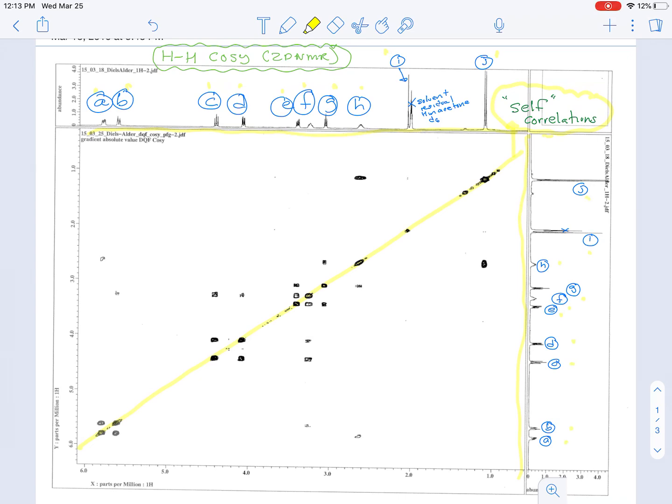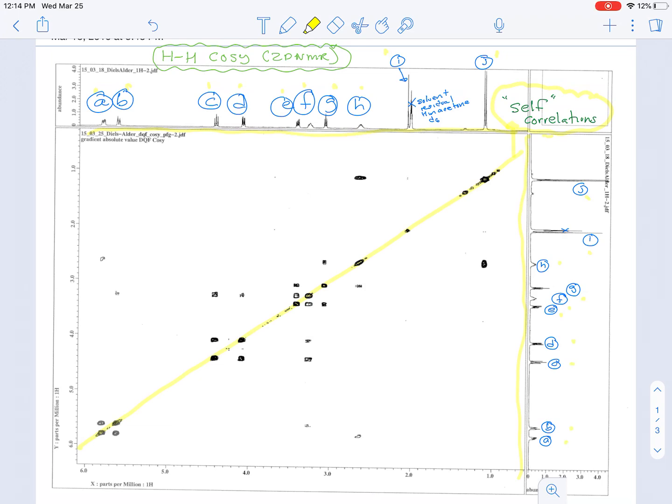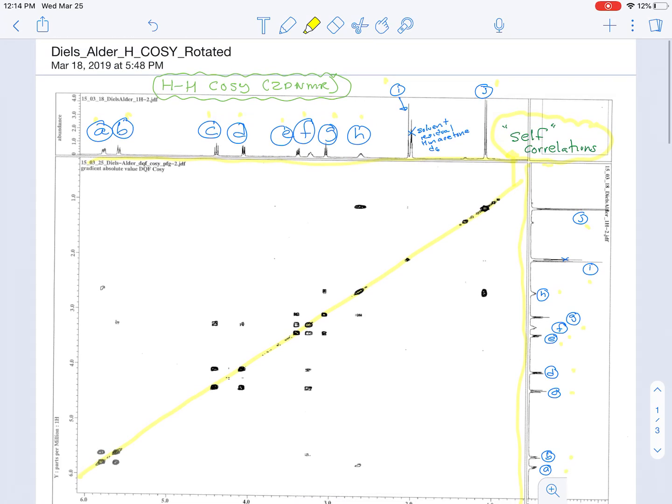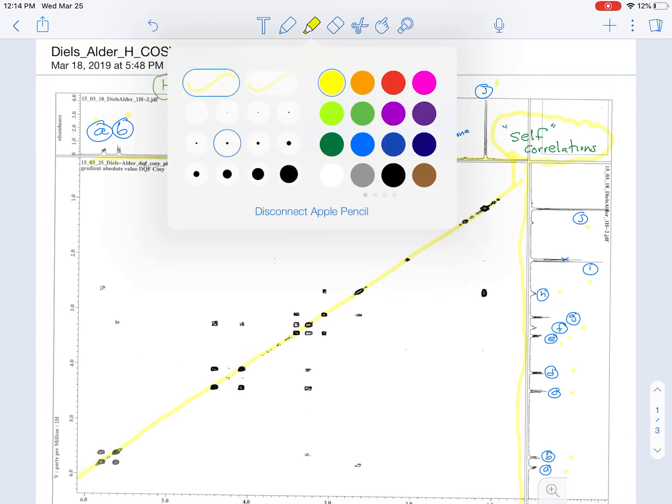And what COSY tells you is which signals or which hydrogens correlate to each other. And in this particular instance, correlation means coupling. And in some cases you can see not just the two or three bond couplings, but also the long range couplings. And so the way that we're going to use this to figure out which signal is which is we're going to start with the one signal that we can unequivocally identify, and that's signal J.